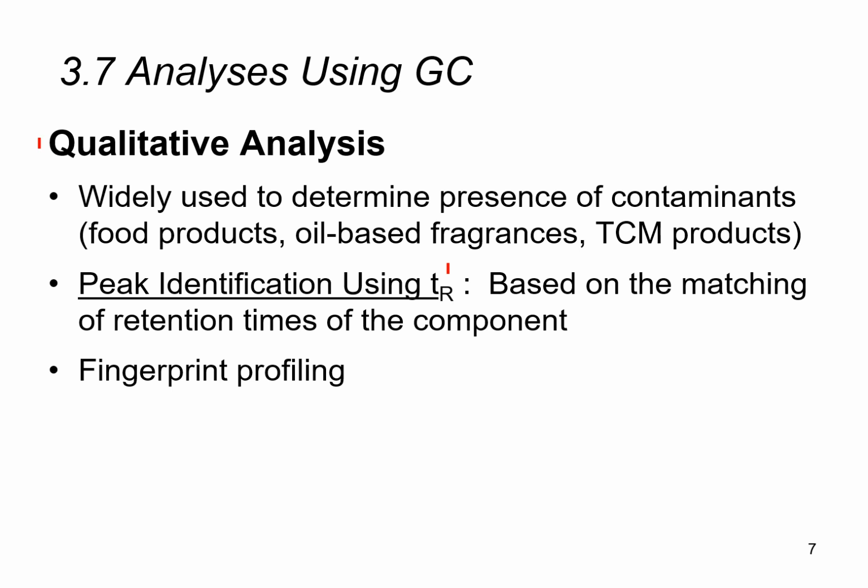So the key is that under the same conditions, using the same instruments, the retention time of an identical compound will always be the same. If ethanol elutes at 3.5 minutes, then each and every time it will elute at 3.5 minutes. So using that property, I can therefore identify whether ethanol is present or not in any given sample.